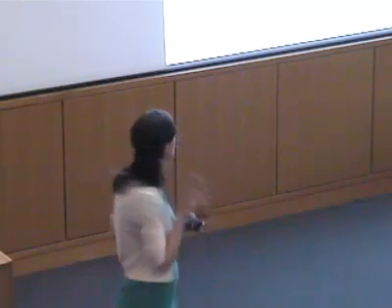Okay, so in the last part of my talk, I'd like to switch gears a little bit from X-ray absorption and talk about what we can do if we instead collect X-ray emission at moderately high resolution. Now, I already told you early on that when we do these experiments, if we have dilute samples, we typically measure in fluorescence mode.